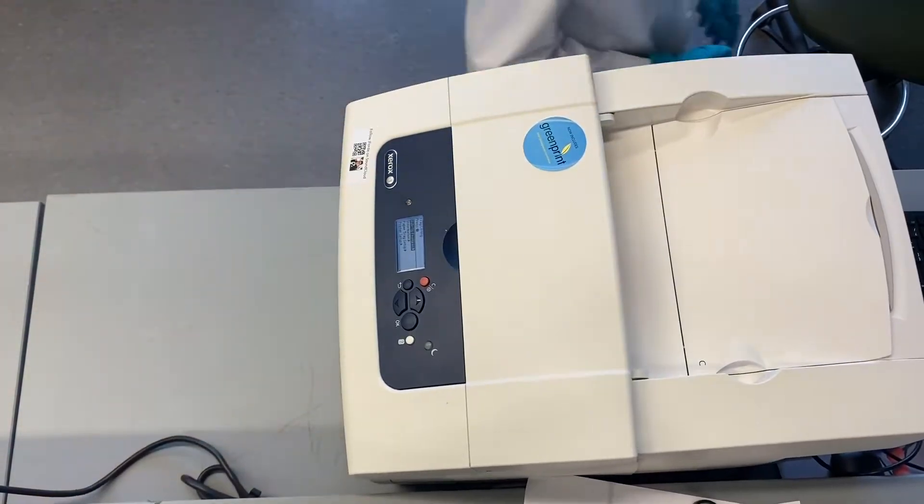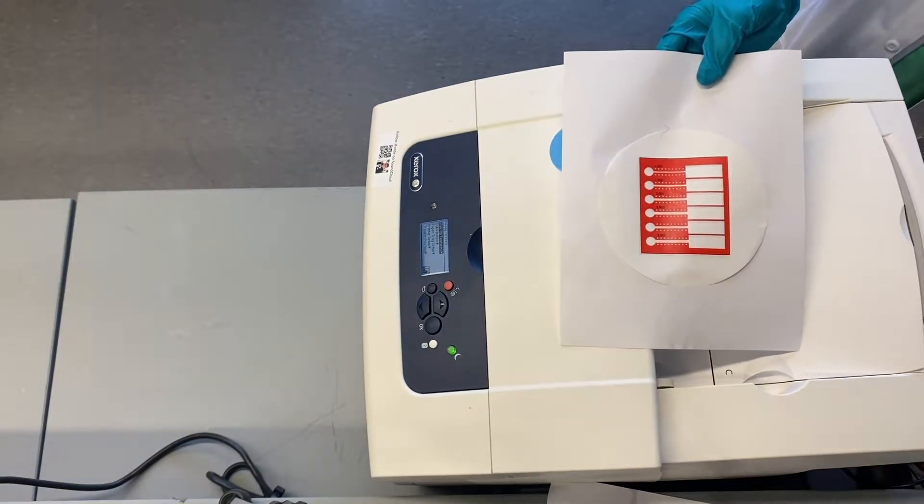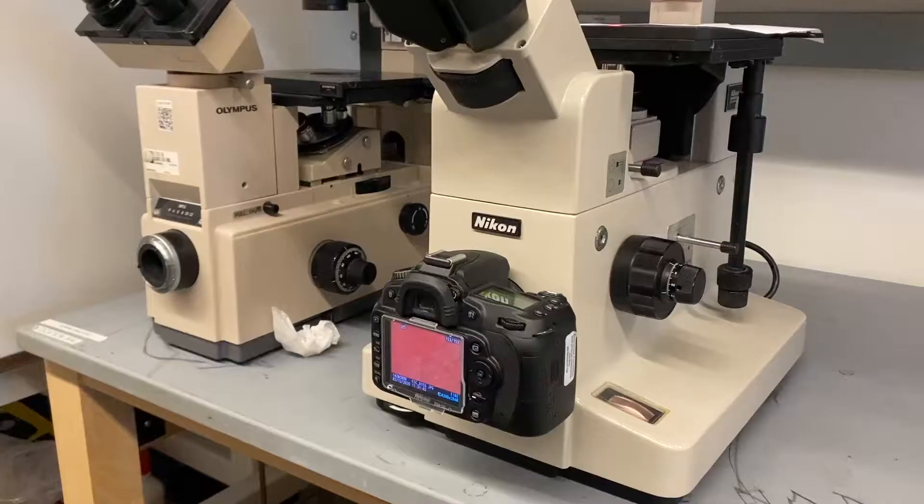Print Microfluidic Device: The device will then be inspected under the microscope in order to ensure that the channel is printed clearly.